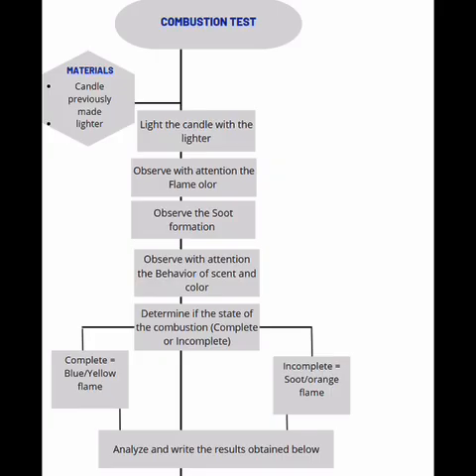A complete combustion is indicated by a blue or yellow flame. In contrast, if there is soot or the flame is orange, the combustion is incomplete. Final step. Finally, we write down our observations and analyze the results obtained during the test.